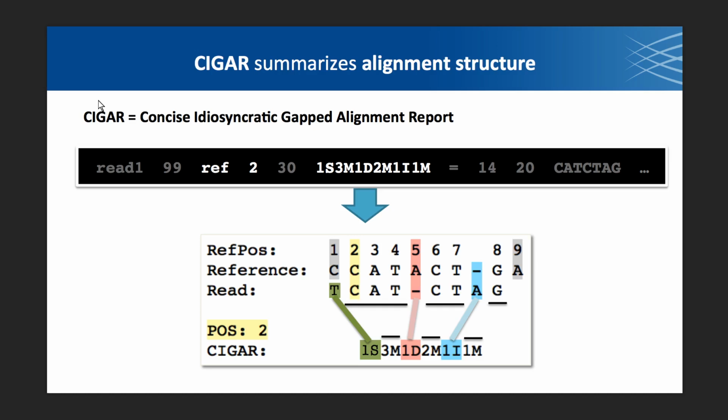Okay, so this is a slightly confusing thing, but if you don't see that in the beginning, then it's very difficult to understand why MarkDuplicates has such a hard time. One of the reasons that one of the tools will have a hard time is because we're sorting by the alignment start, not by where the read actually starts. So the read starts at base 1 here. The alignment start is at position 2 because we have 1 base that's clipped. All right, so 1 base is clipped. We start at position 2.